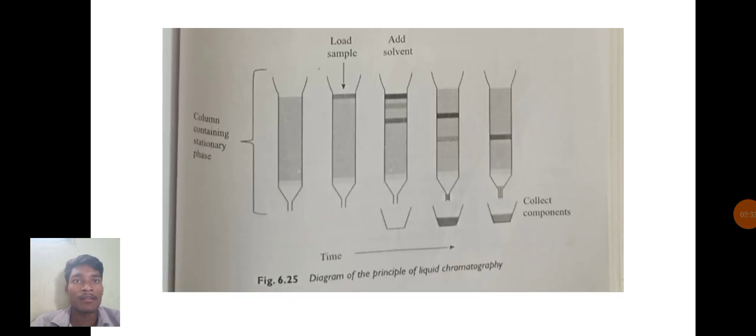Next slide. This is the diagram of the principle of liquid chromatography. Load sample, add solvent, so many items.